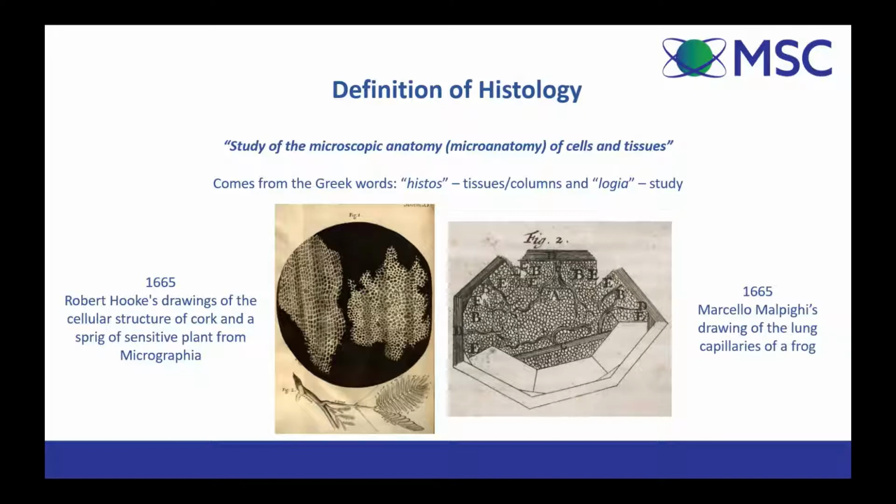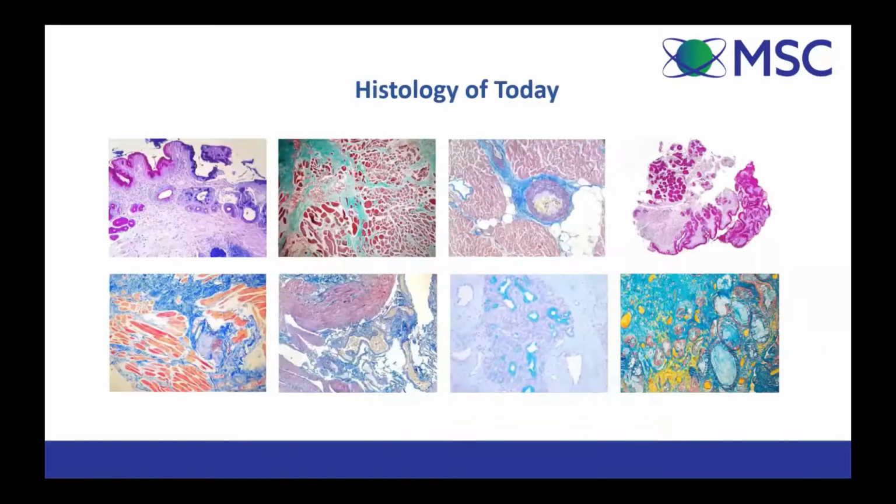You can see they start off with very basic drawings, but the histology of today is far more complex. We've come through in leaps and bounds. Not only do we do single stains now, you can do a whole multitude of combination stains to result in some incredible images that are both structurally informative as well as incredibly pretty.